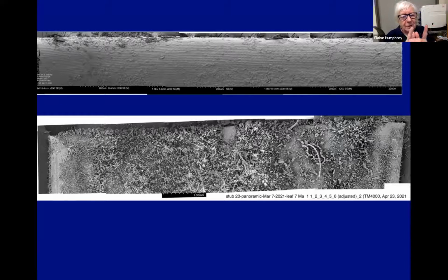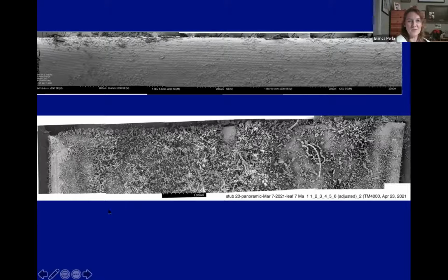It's quite narrow, the width of the eelgrass. We looked at how much we needed. There's a 1 millimeter scale bar there. So this would be the length of the eelgrass across, but just a small piece of each area of the eelgrass. What was the question again? Whether you can mark a place and return to it.